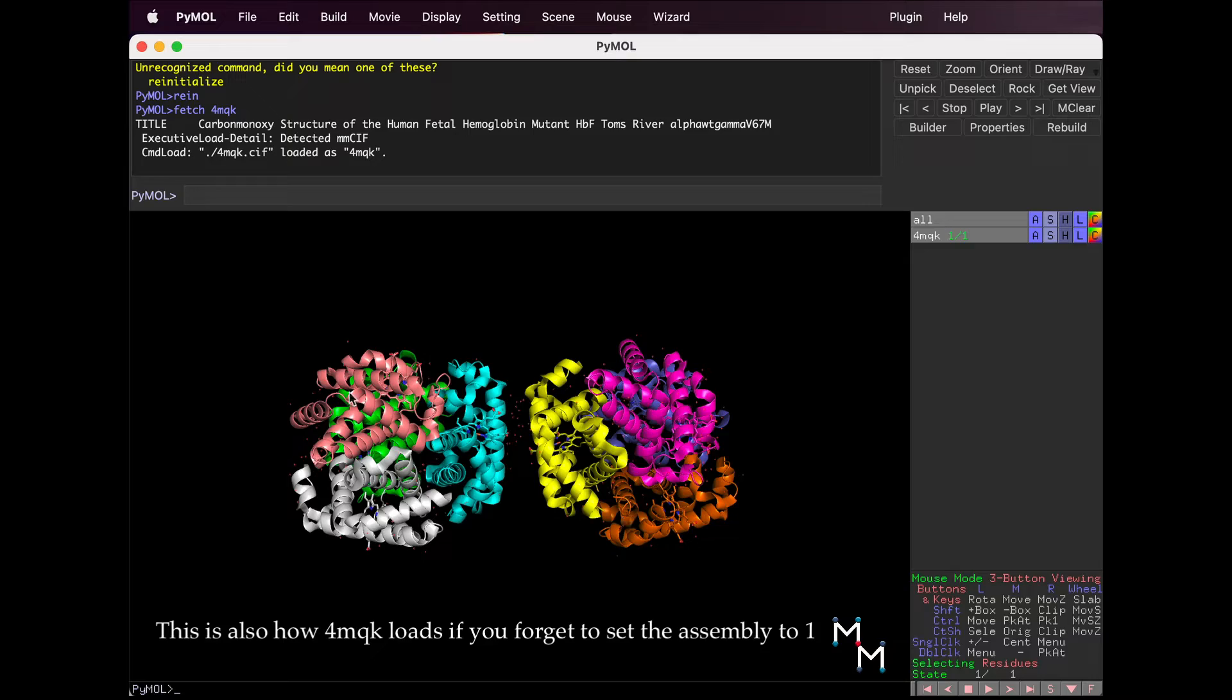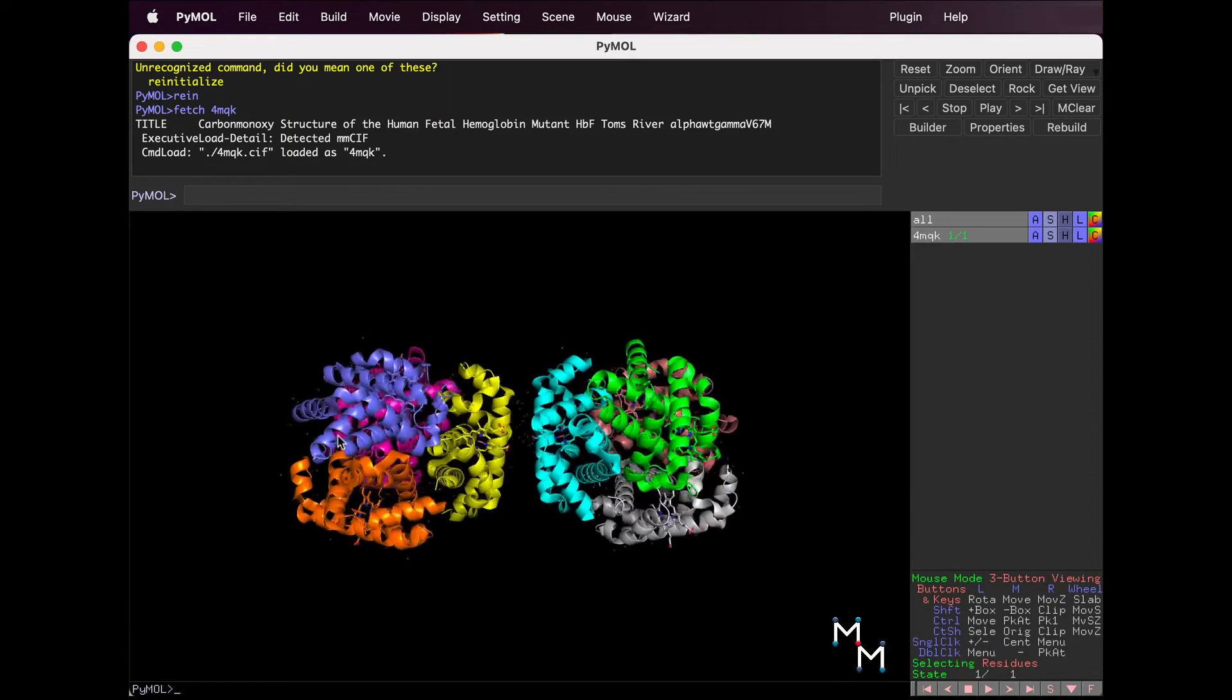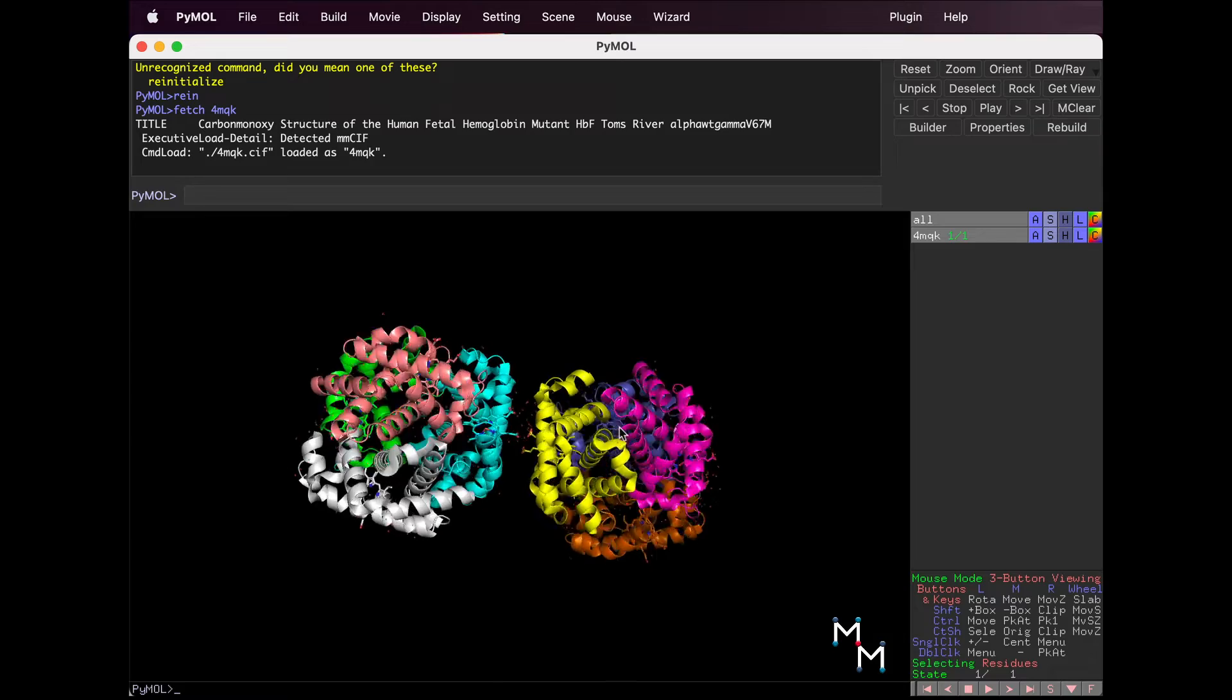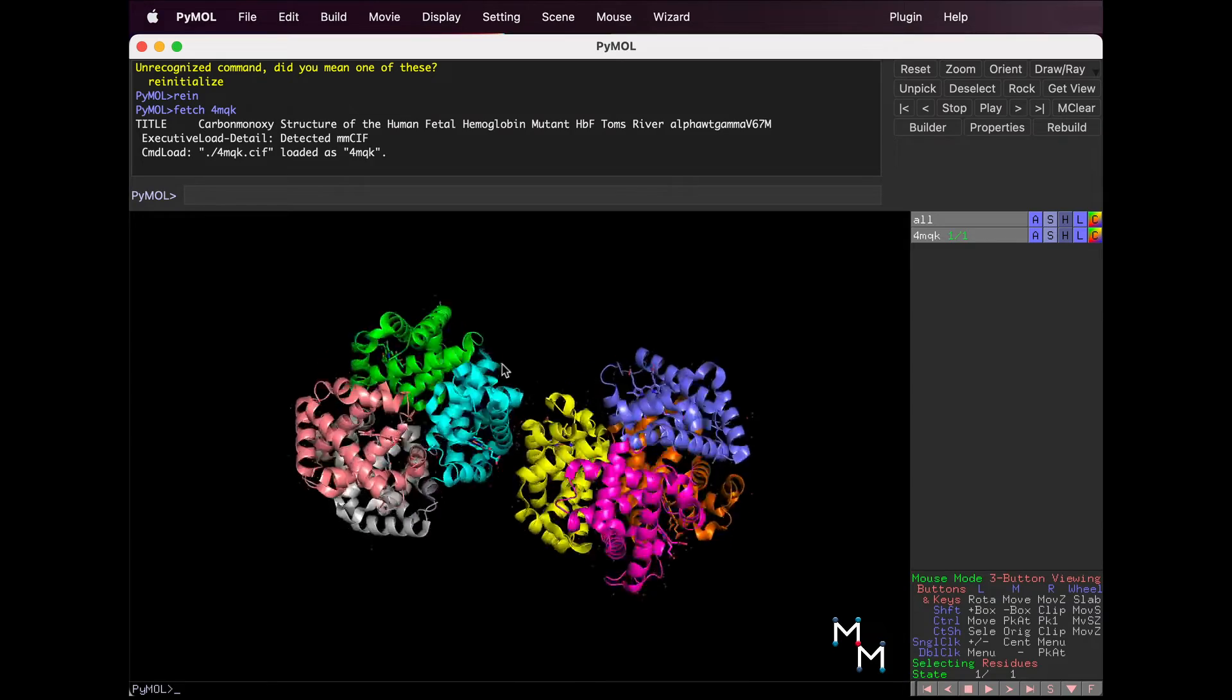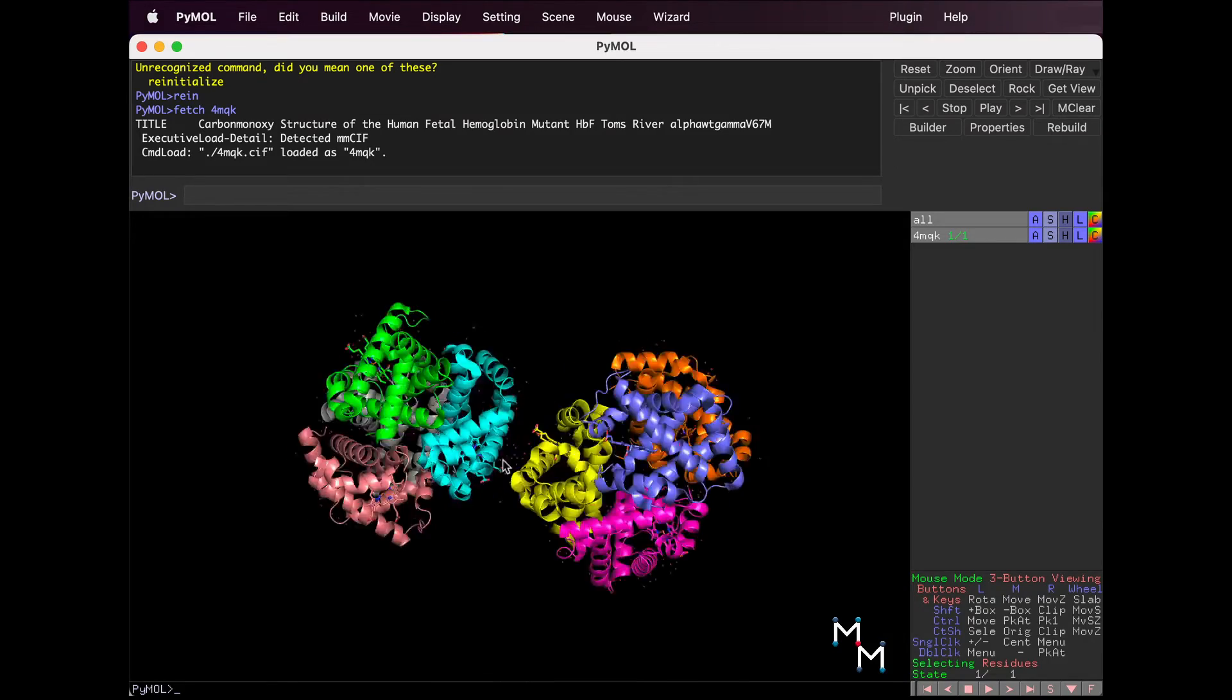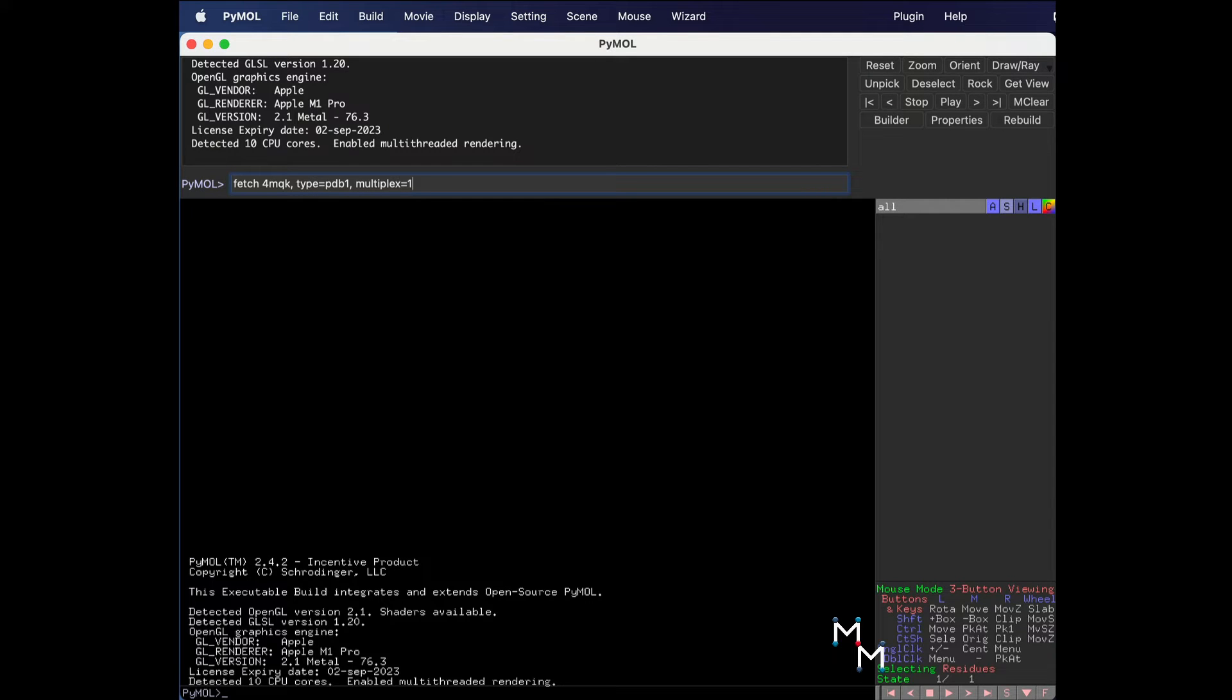Without getting too deep, the Fetch command by itself loads the structure in a way that's related to crystal structure symmetry, which will sometimes show extra stuff and sometimes display half a protein.